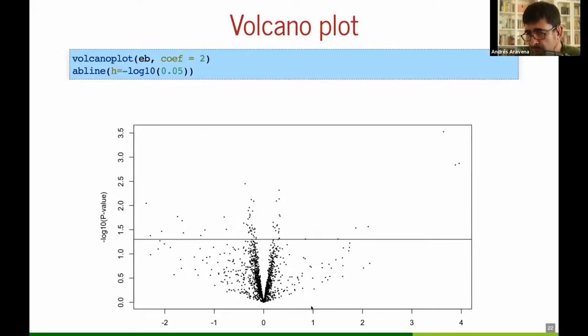So a rule that I personally find makes sense is to cut here at +1 and -1. Why +1 and -1? Because this fold change is counting how many times you duplicate. In other words, this essentially corresponds to the log in base 2.